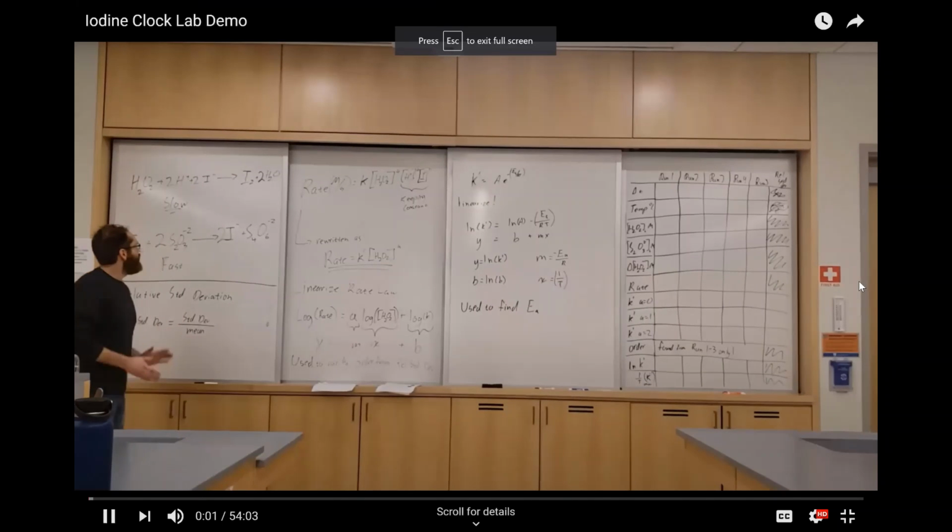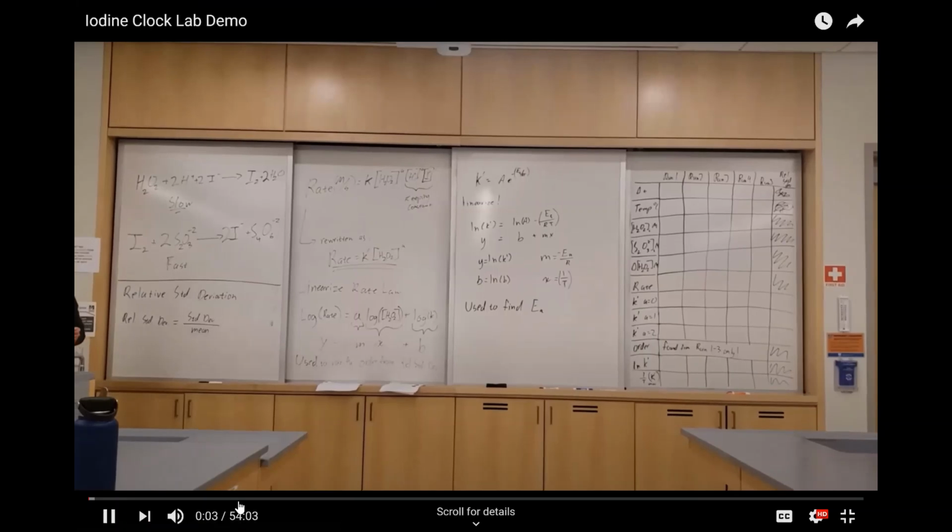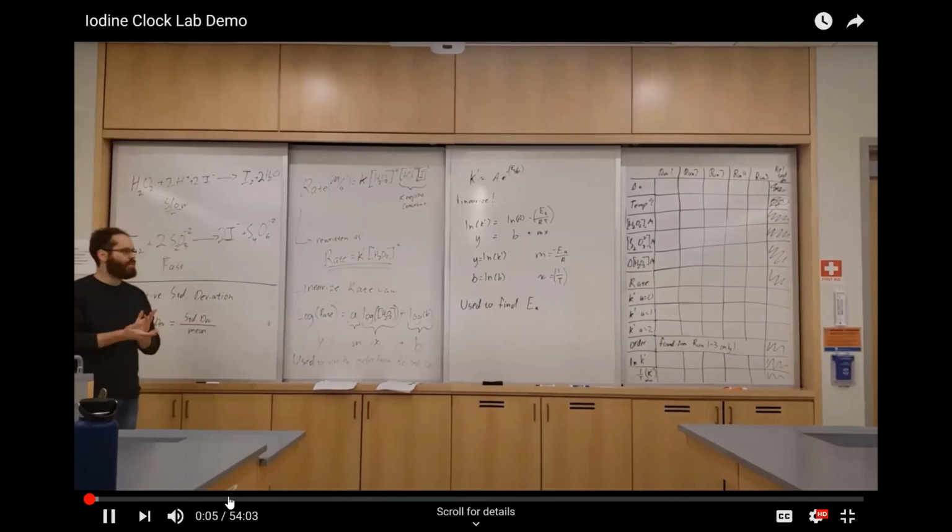All right, so this is the pre-lab lecture for the iodine clock experiment that you all would be carrying out if you were here.